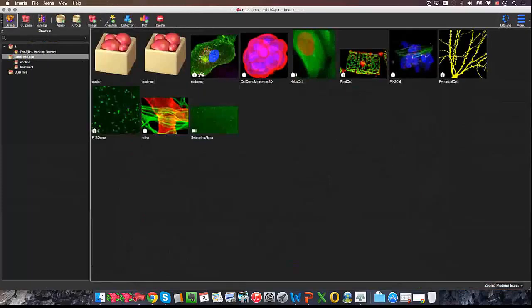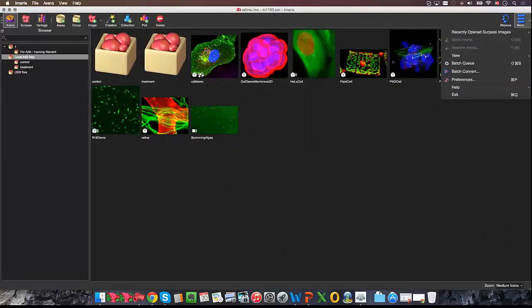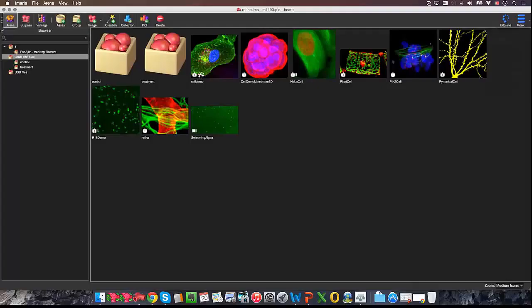So some of the things that are new, one thing I didn't mention, you might not have noticed, but the menu bar is back at the very top. Did any of you request that? One? Okay. So we have changed that. We had removed it from the top and put it all under this kind of multi-tab thing on the right-hand side. But it turns out this is not so popular or usable. So we reintroduced the menu bar on the top.